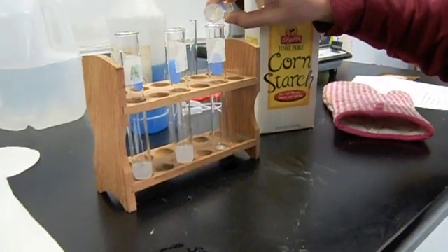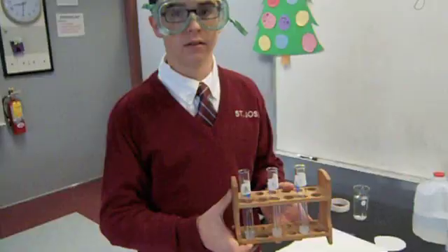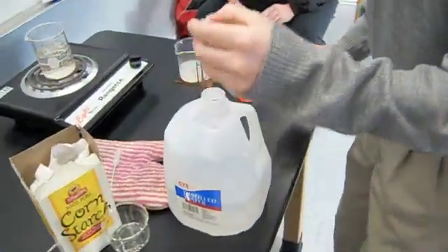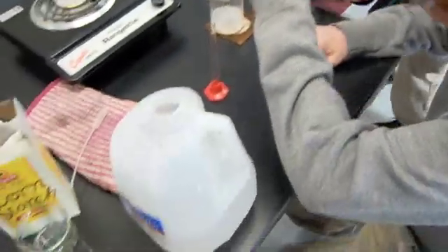We have prepared three tubes of saliva marked A, B, and C. In tube A, we are adding two milliliters of vinegar. In tubes B and C, we are adding two milliliters of distilled water.